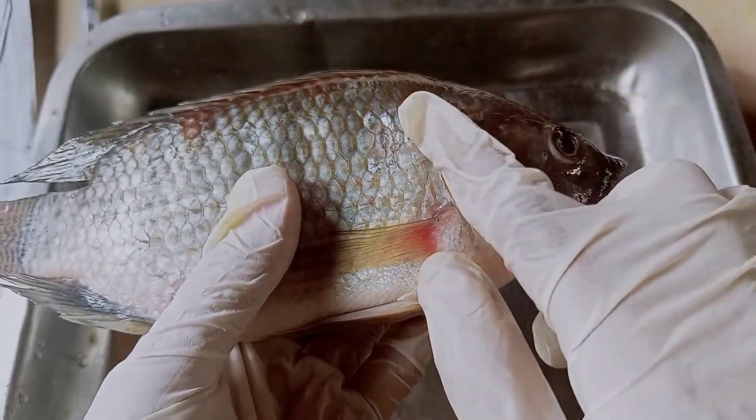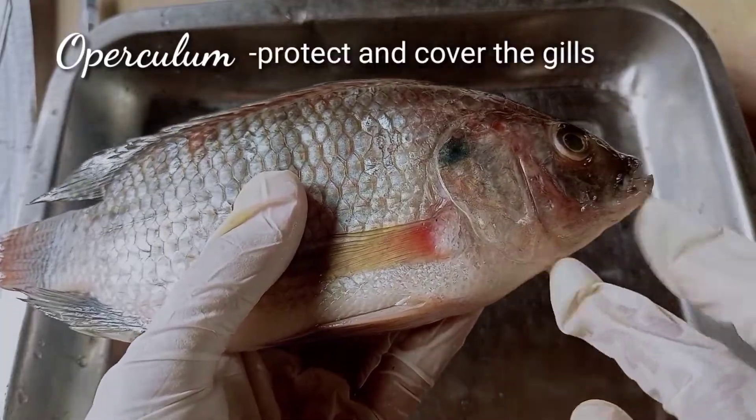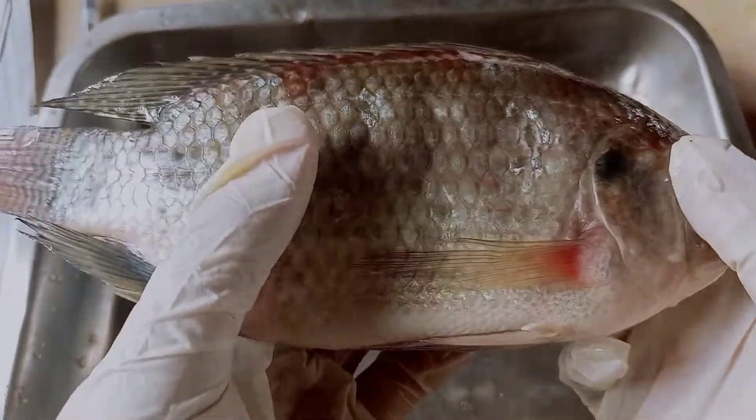Here we have what we call the operculum. This is what protects and covers the gills of our tilapia.